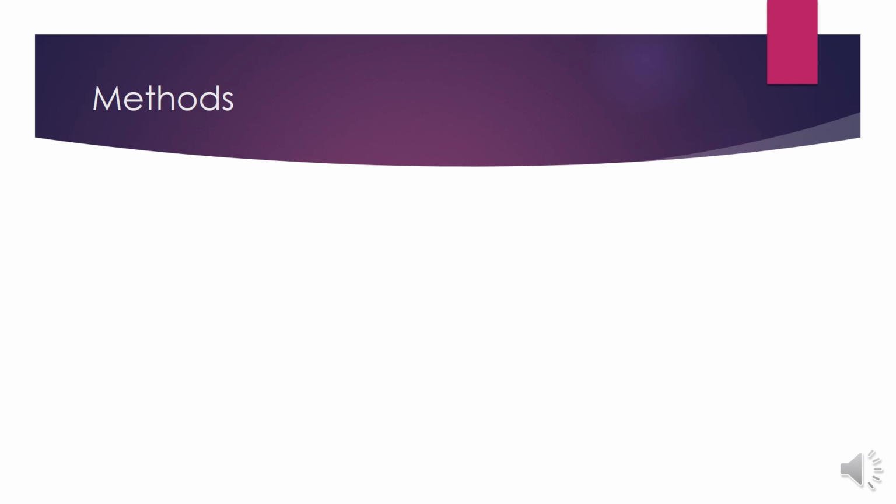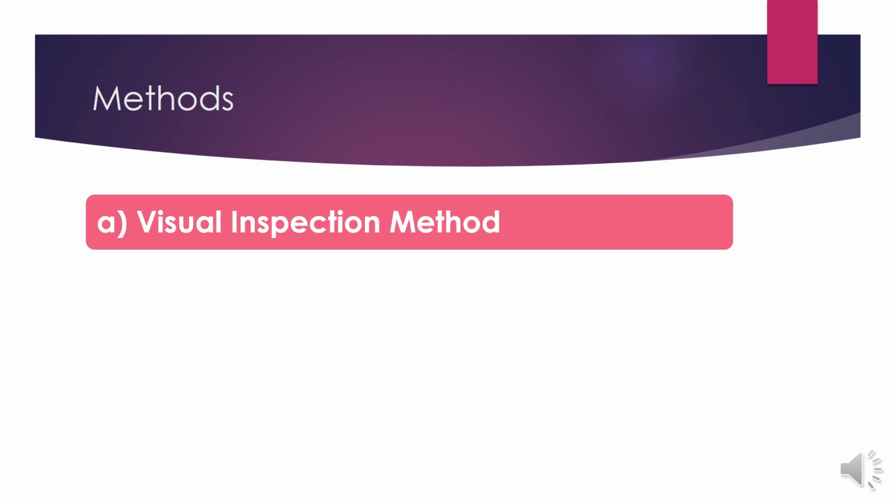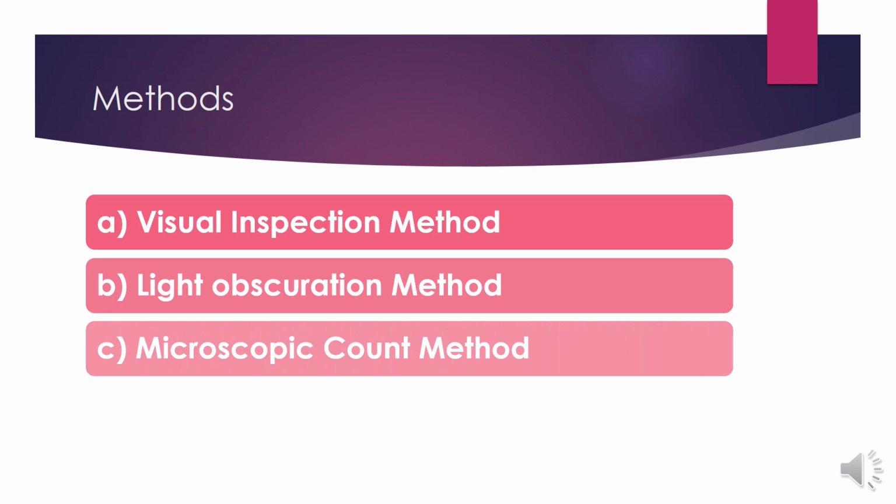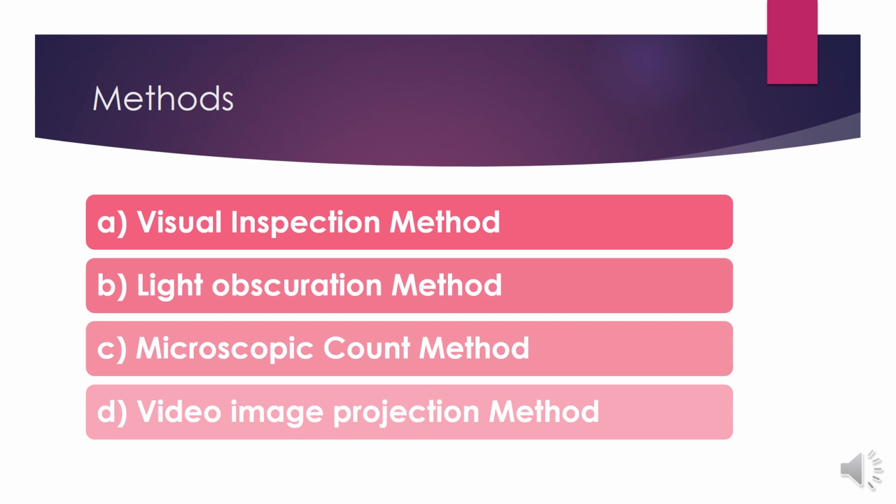So various methods that are employed for clarity test or particulate evaluation test include visual inspection method, light obscuration method, microscopic count, and video image projection method.